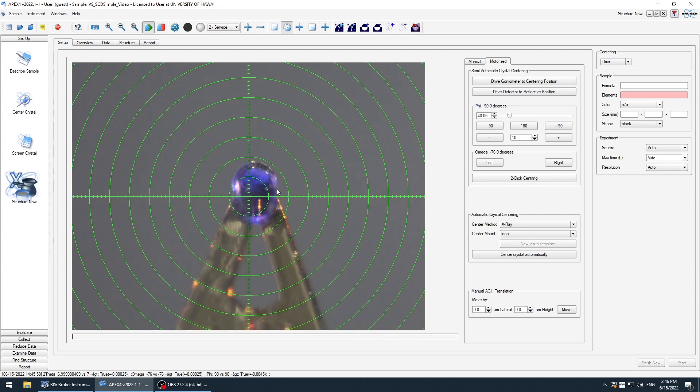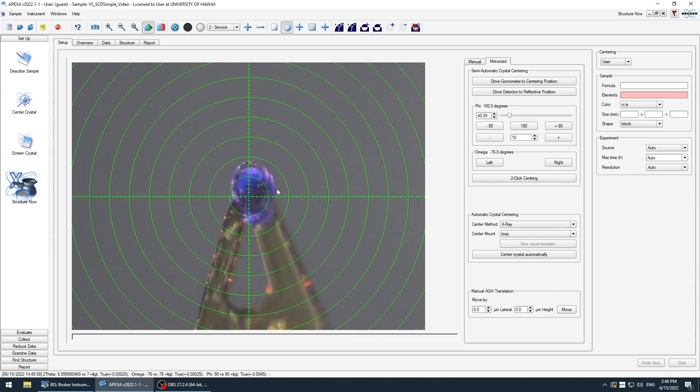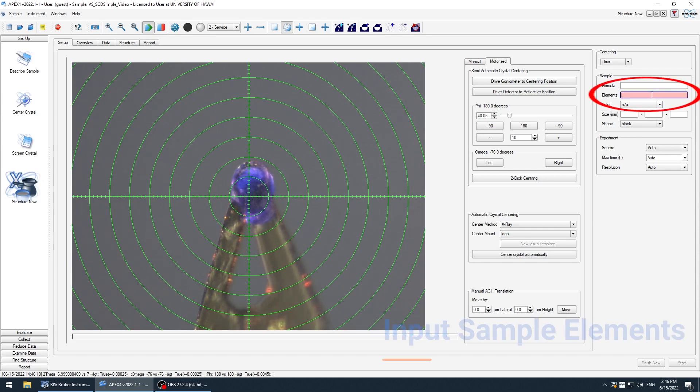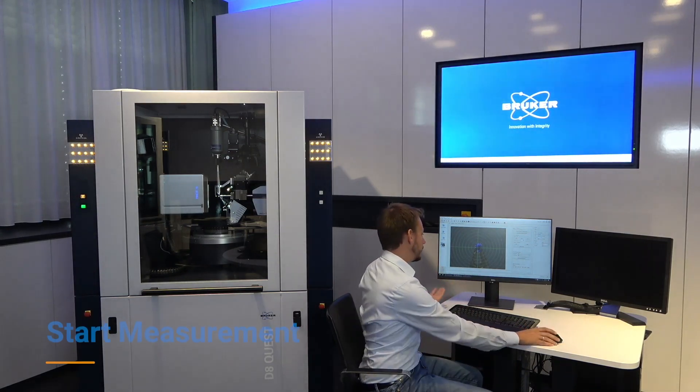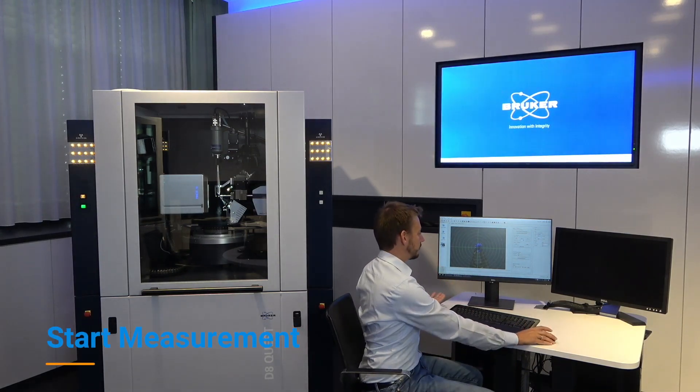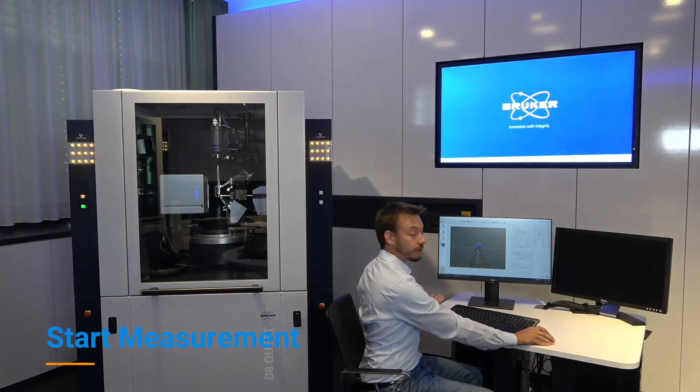The elements involved in the structure that are contained in the structure, you have to enter them here. In this case, this is copper, carbon, hydrogen, oxygen. The coefficients are not necessary here. And that's all information the software needs. So the only thing we have to say now is go.